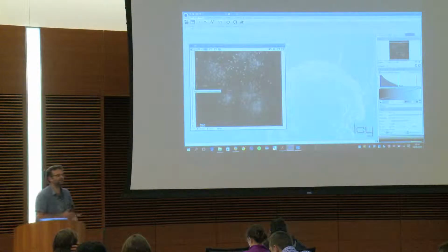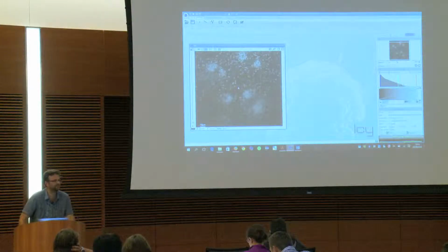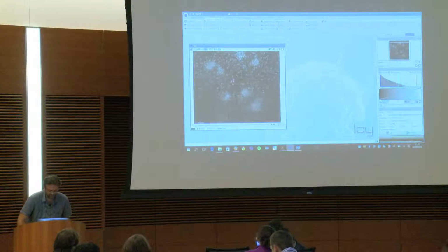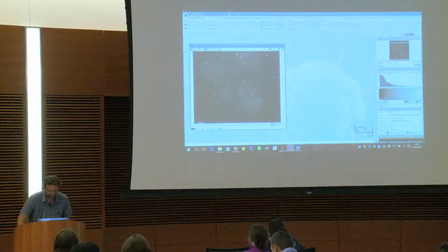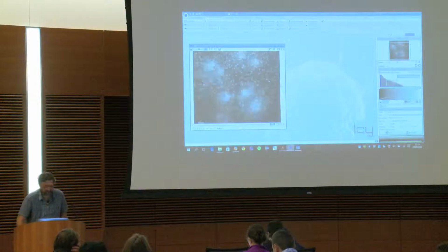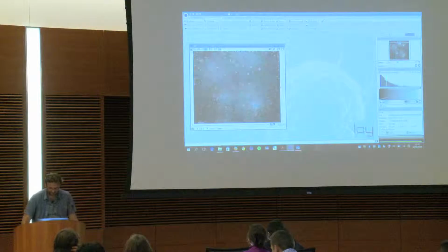So in IC, we decided to put sliders on the side when it is Z. And if this sequence is in time, you would have a player. And it's very easy to convert a stack to a player. In the sequence operation, you just press convert to time, and now you have a time player. And here you can specify the number of frames per second you want to see, and this thing is rolling. I need to enhance the contrast for the beamer.